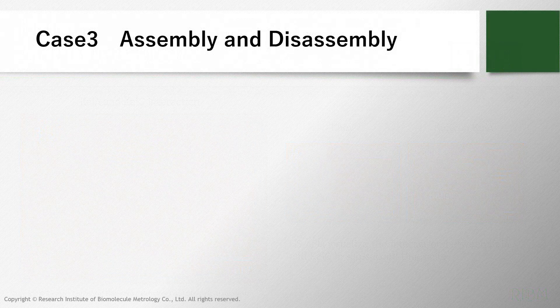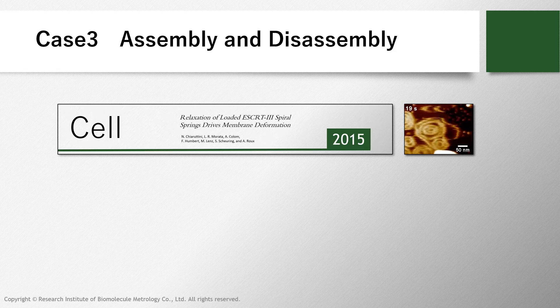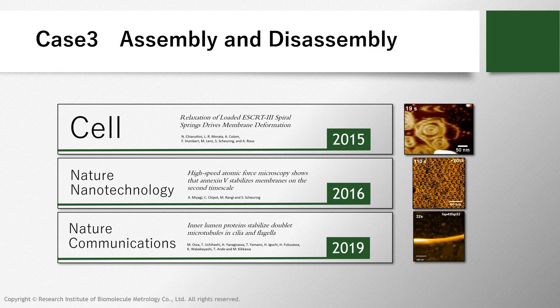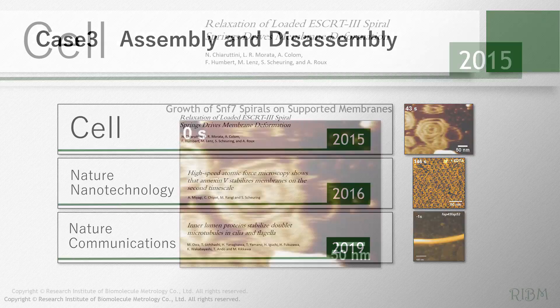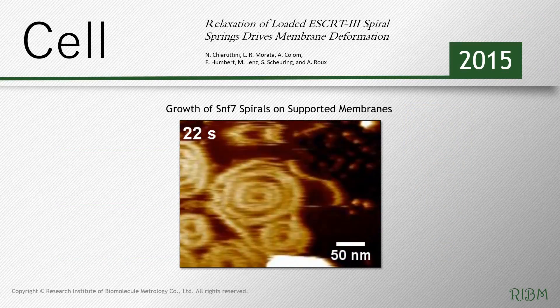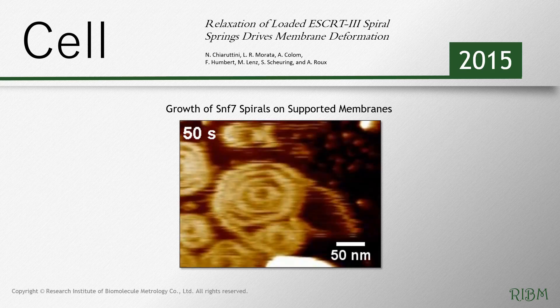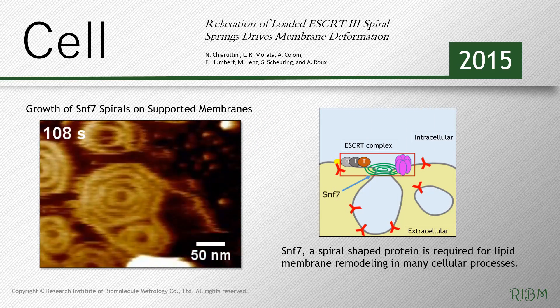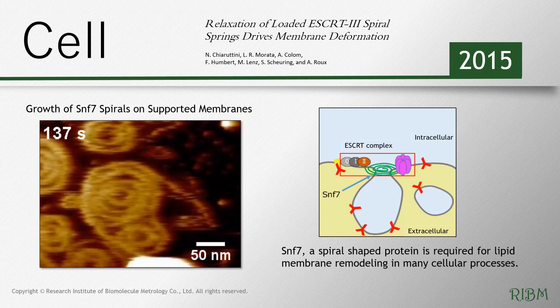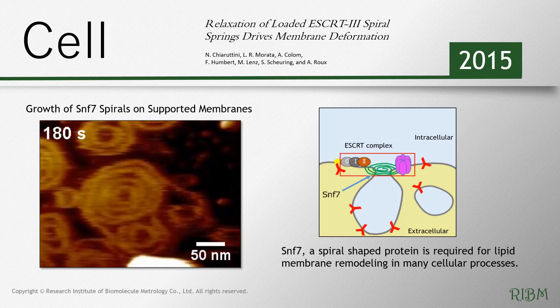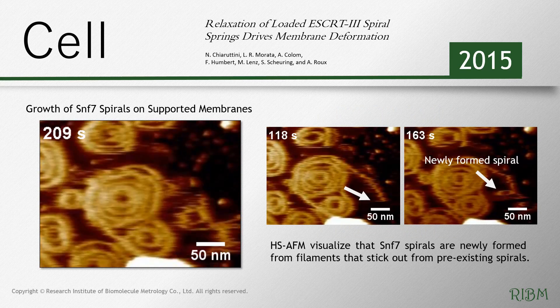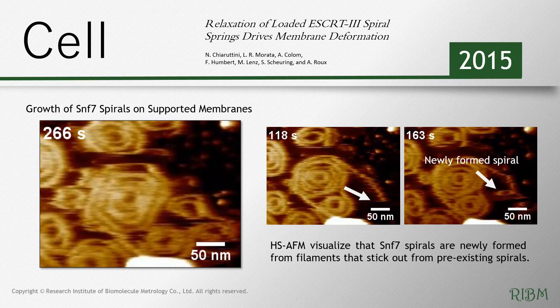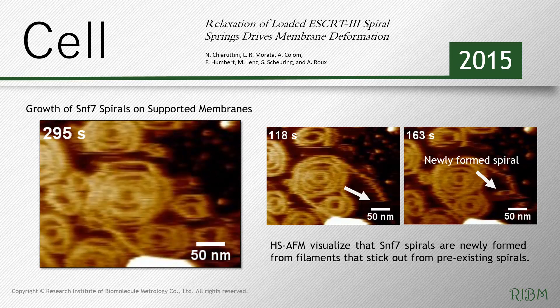Next, in the assembly and disassembly section, we will introduce another three videos. The video shows the growth of SNF-7 spirals on supported membranes. SNF-7, a spiral-shaped protein, is required for lipid membrane remodeling in many cellular processes. High-speed AFM visualizes that SNF-7 spirals are newly formed from filaments that stick out from pre-existing spirals.